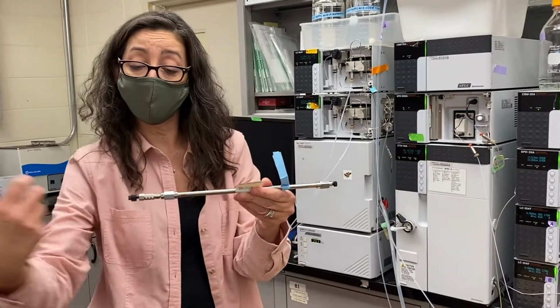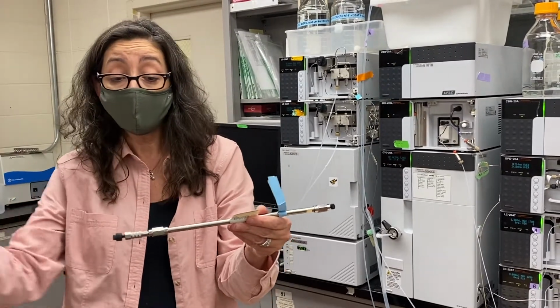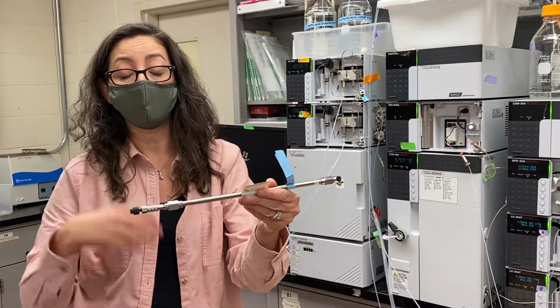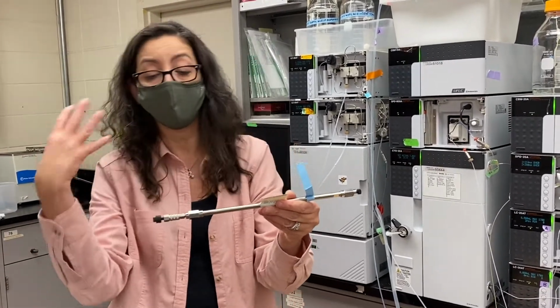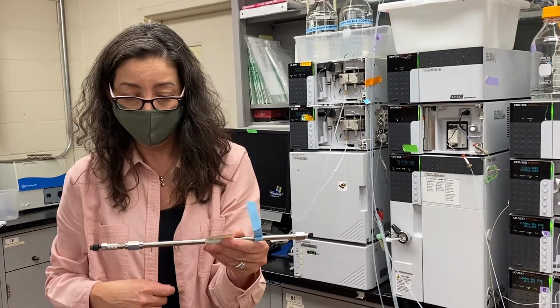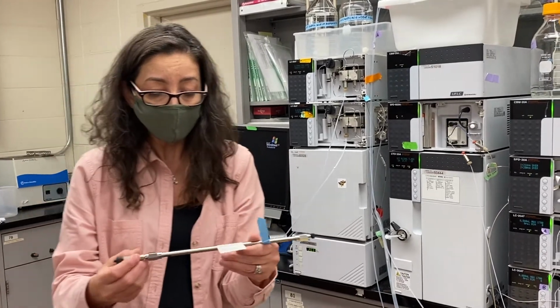So what happens is when you inject your sample and it goes onto the guard column, it is going to absorb the impurities. And the rest of the sample is going to go on the column and get separated, and the guard column protects the column. So the guard column usually is replaced over time, like every 3 months potentially. If you're using it a lot, you would want to put in a new guard column. Otherwise, it'll be saturated and the impurities will start going onto your column. And also, you will start having high pressure on your system, which you don't want because it would damage the column.